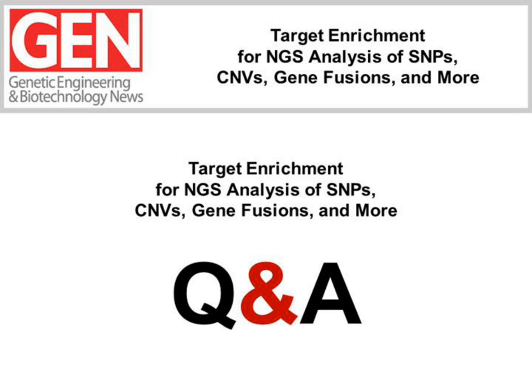Okay, here's another question. Can non-model organisms be used for the custom target enrichment solutions, i.e. customer supplies target region in BED format and reference genome in FASTA? Yeah, so this is Jonathan. That's absolutely something we can do. We can use any FASTA sequence that you provide, as long as you can also provide us the regions that you're interested in targeting. While we've focused generally on human, we've done mouse, rat, a couple of different plants, and some viruses. So we have the pipeline set up to be able to handle that pretty easily.